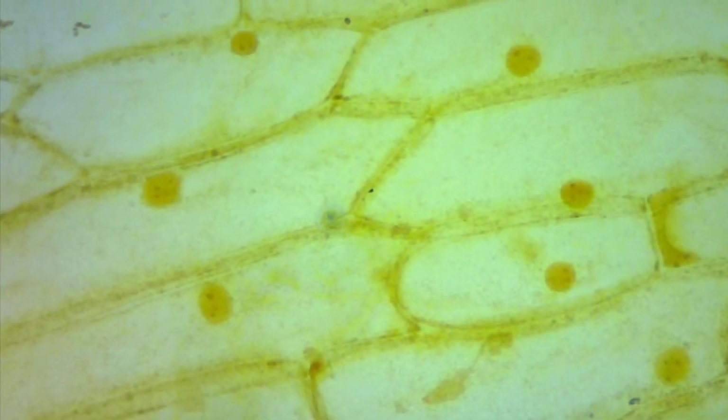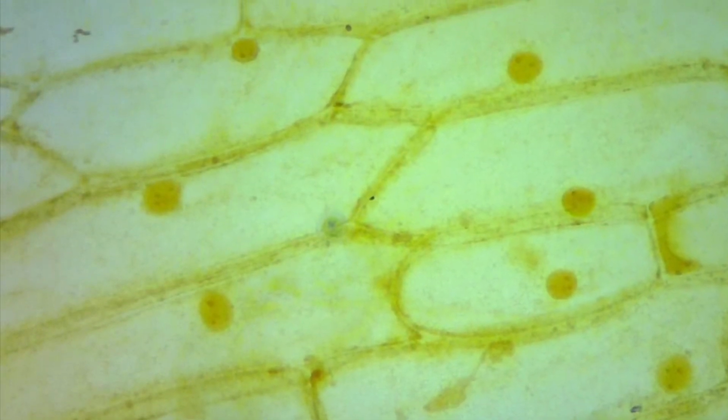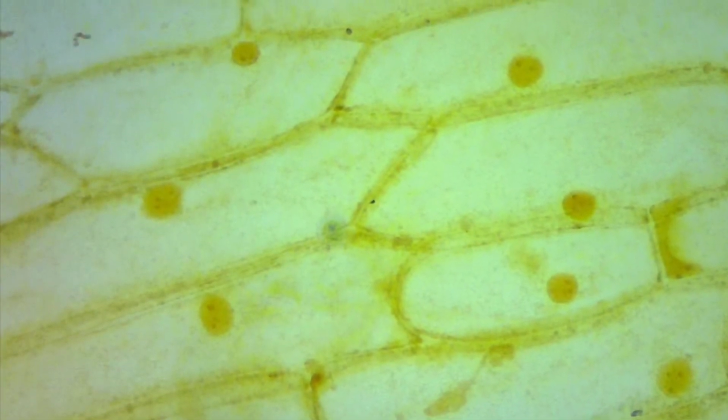Looking at the onion cell, you will observe the following. A cell which is the smallest unit of life. Looking closer, you will see a group of cells making up the onion cell membrane. The onion membrane is composed of many cells. This makes the onion membrane multicellular. A multicellular membrane contains many cells attached to each other.